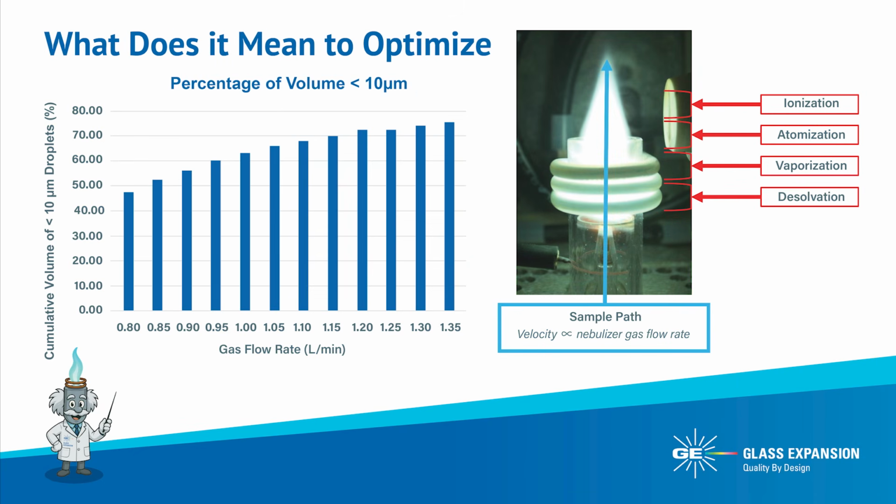And finally, we just discussed the importance of optimizing your nebulizer operating parameters, in particular the nebulizer gas flow rate for ICP-OES and ICP-MS using a multi-element tuning solution to ensure optimal analytical performance.